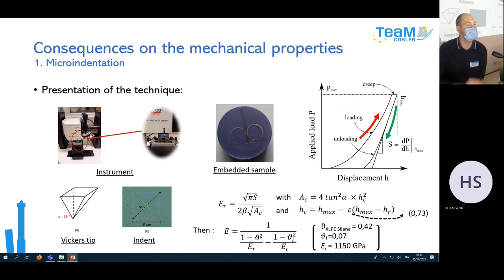Okay, so you measure the difference between the lowest point and the point when you release. So you measure just the elastic deformation. Exactly. And you just take away the plastic part. Exactly. That's what we call the green phase. So at the release, you measure the slope of this. Okay. So that's the S. It's not like a classic Vickers test.